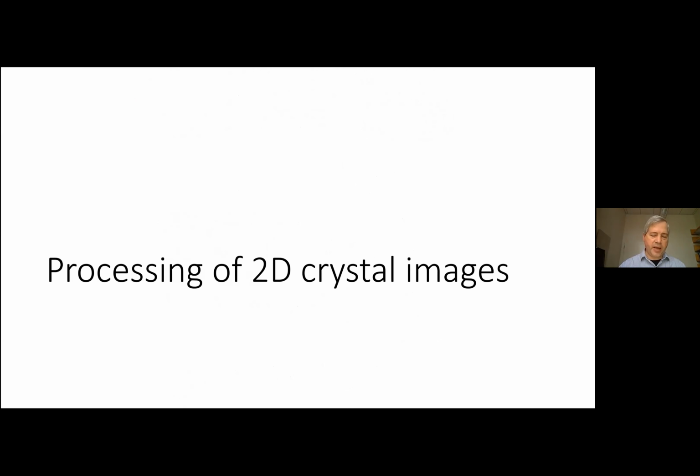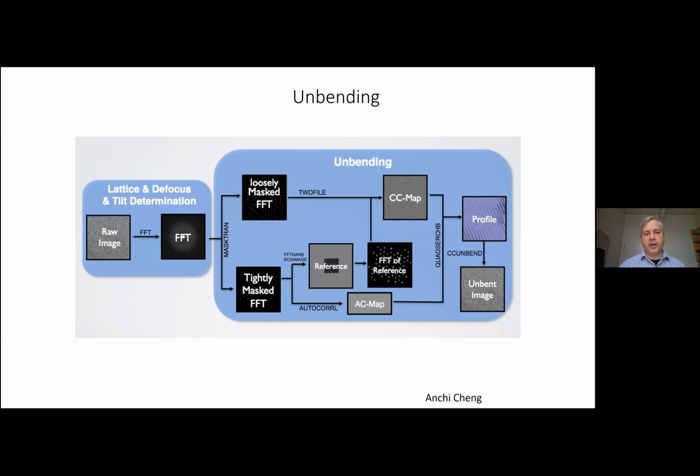More images than you didn't need to collect too many diffraction patterns, but you needed some just to get an accurate estimate of the amplitudes. The processing was complicated, I would say. The main thing is you had to unbend them. Even the crystals themselves, as flat as they were, are not perfect, so there may be some distortions in them.